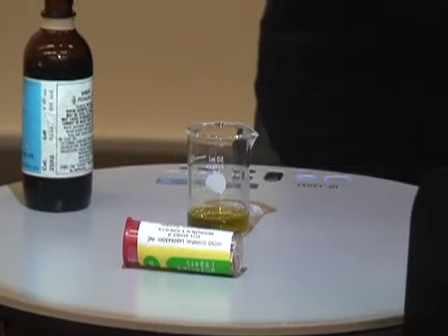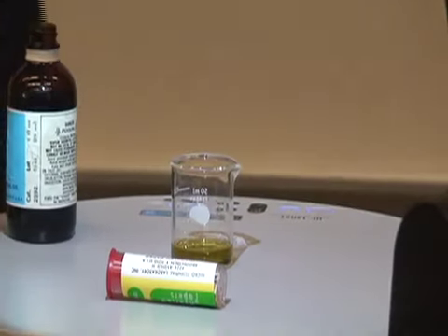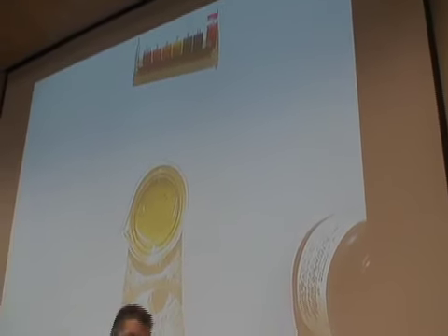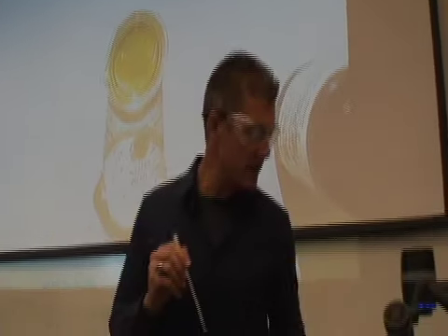Now, I'm going to do a demo for you really quick. This demo is what I want you to write up. Okay? This is the first part of this demo that I want you to write up. I want you to first hypothesize what's going to happen.